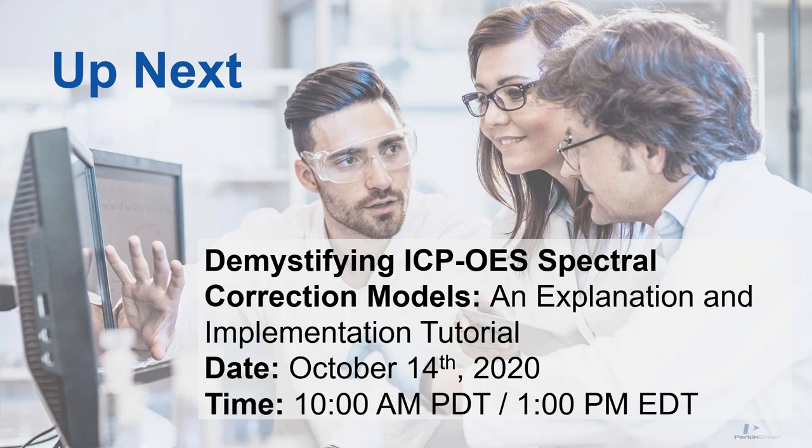So that was kind of a lesson for me to learn. Always, whenever there's a possibility of interferences and you know what they are, always run the single element standards at the high concentrations in which you'll be looking at. Just try to find out if there are any interferences present on your analytes. That's kind of how we did also with that phosphorus work, when we did the phosphorus in the nickel alloy. Same type of thing.